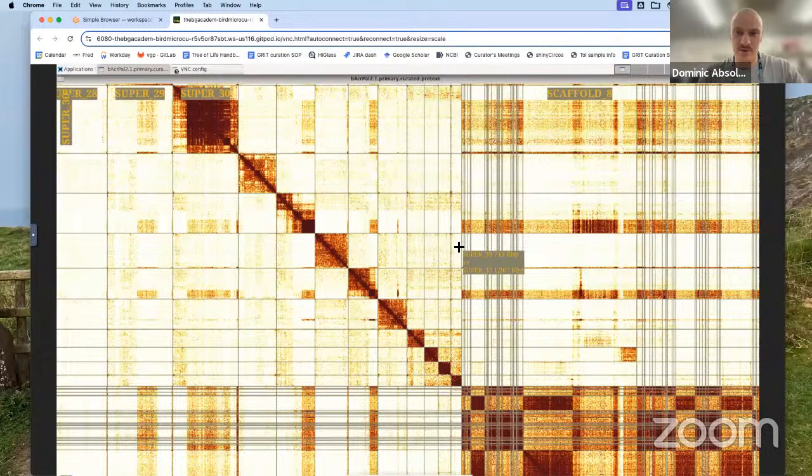Even if it's not ultra long, right, Tom? Yeah, I think it doesn't have to be ultra long. I think because of what we can see with the mapping of the hi-fi reads and the nanopore reads back to the nanopore assembly, the problem is mostly caused by the sequencing dropout of the hi-fi reads in certain regions of the chromosome. So just having sequence coverage of that region with your nanopore reads, I think will enable you to actually assemble the chromosomes much better and make it much easier to curate. And you should have less missing content.